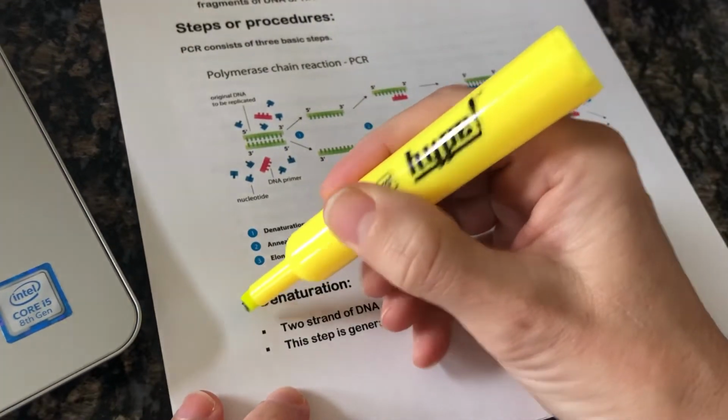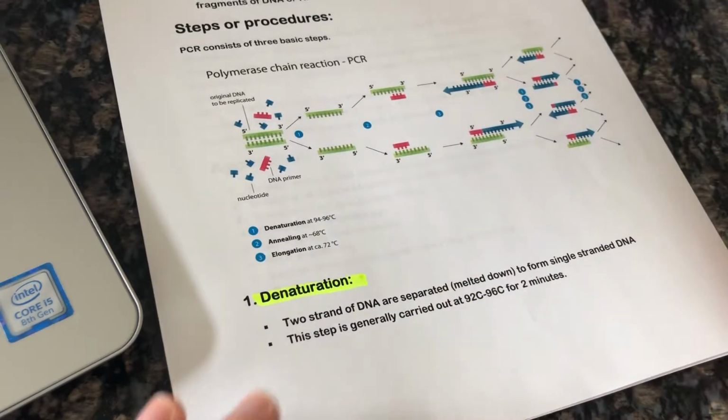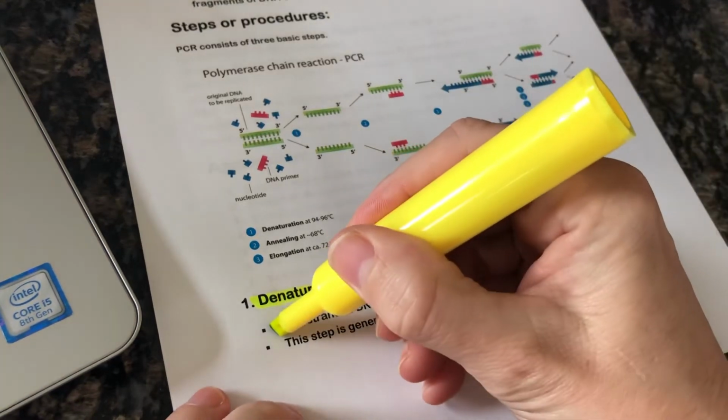You have to denature your DNA, okay? So denaturation, normally we don't think that's a very good thing. We have to take the molecule apart. All right, so you would have heard the term denature way back in Unit 1 when we talked about proteins. Okay, so the two-stranded DNA has to be separated into single strands. All right, so we're going to denature.